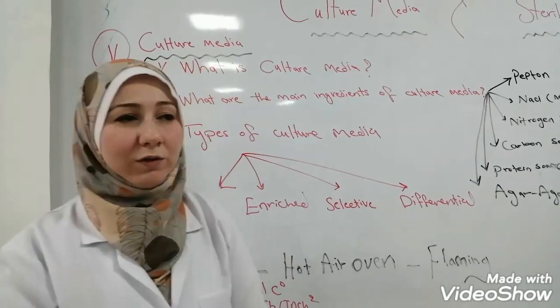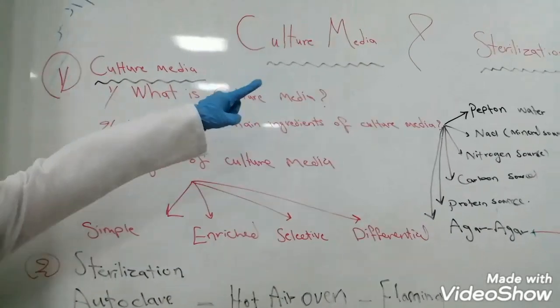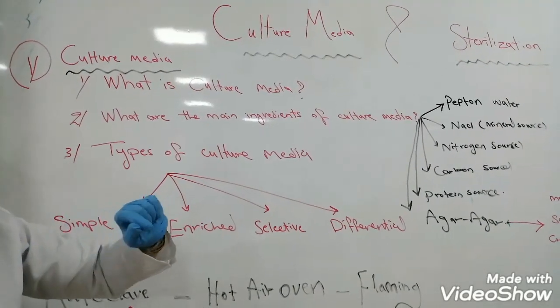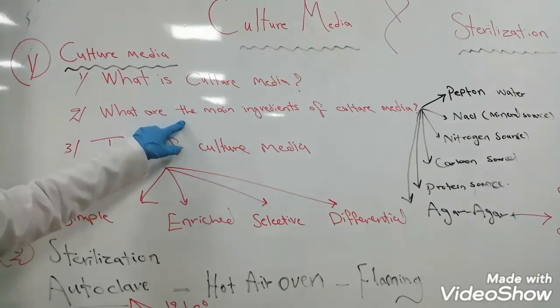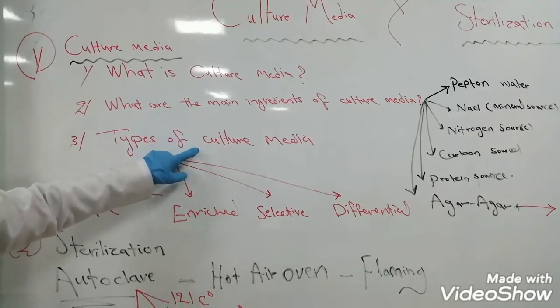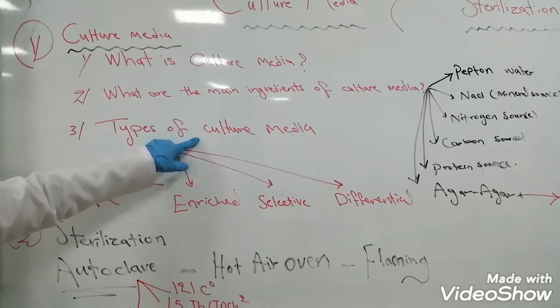Our lab today concentrates on culture media and sterilization. The main objective is to know what culture media is, what the main ingredients of culture media are, and what the types of culture media are.